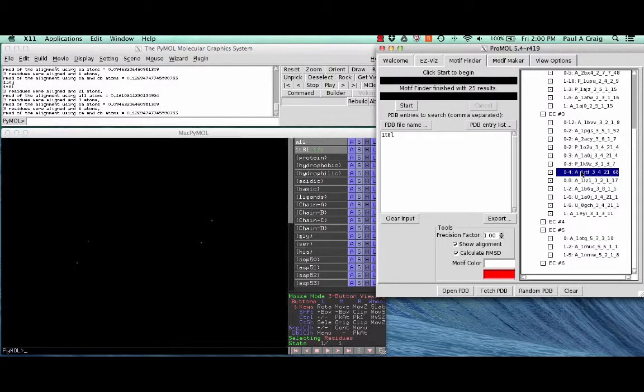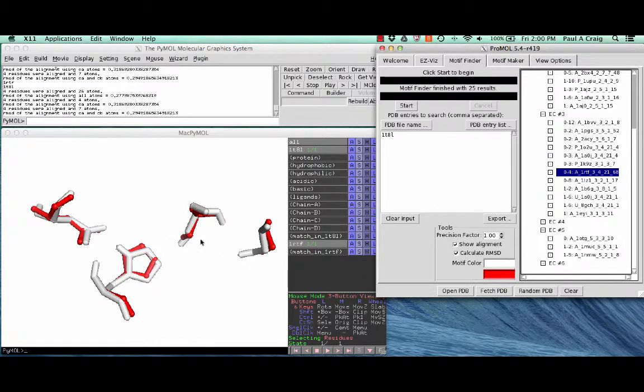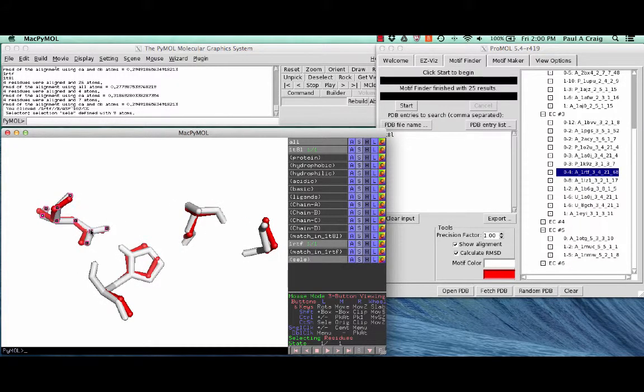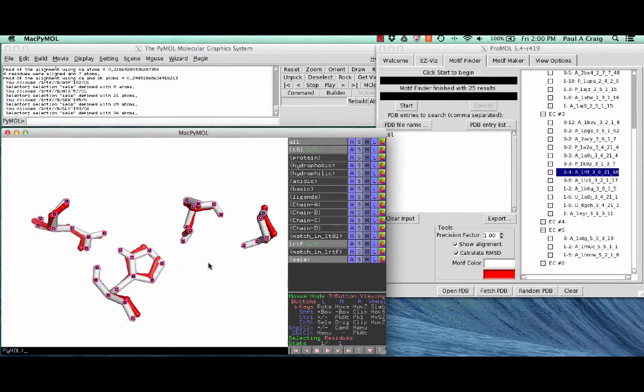So now we're doing a comparison to a structure called 1RTF. Now 1RTF is also a type of a serine protease, and this particular protease includes not only an aspartate, shown here, a histidine, a serine, but it also includes a glycine. And some of the serine protease motifs include a glycine as a certified residue in that motif. And you can see once again we get a very nice alignment here between 1T8L, which is some type of a serine hydrolase, probably a protease, and in this case 1RTF is another motif. There are a number of other serine proteases in here, including a couple of motifs that I created myself. Here's a user motif for 1A0J and a user motif for 8GCH. The U stands for user.